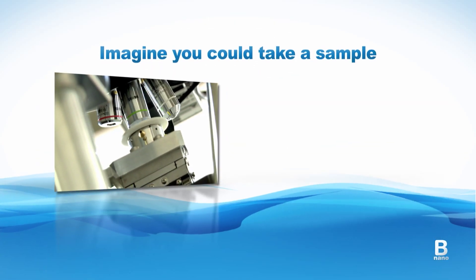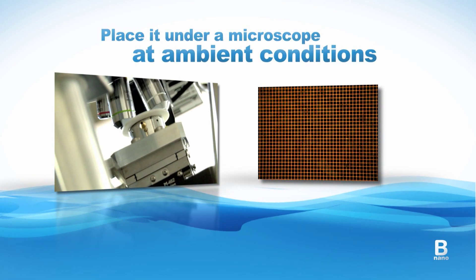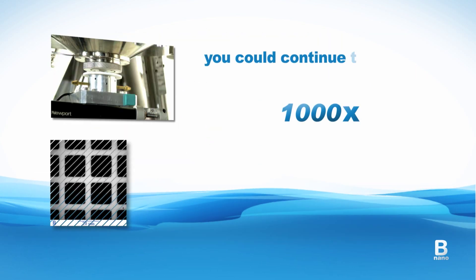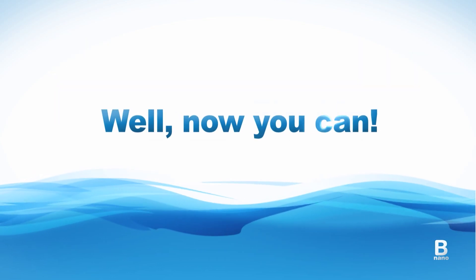Imagine you could take a sample — any sample — place it under a microscope at ambient conditions and rather than stopping at say 1000x, you could continue to magnify all the way up to 500,000x. Well now you can!